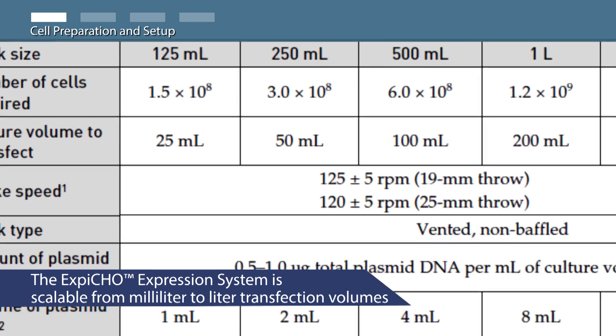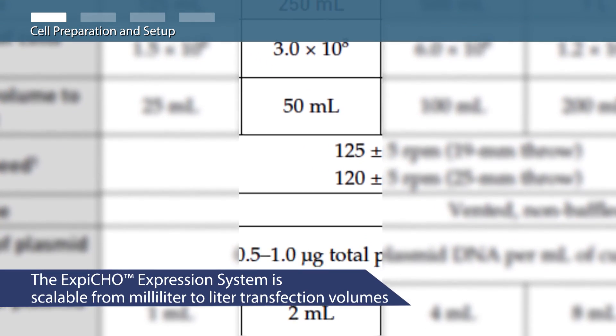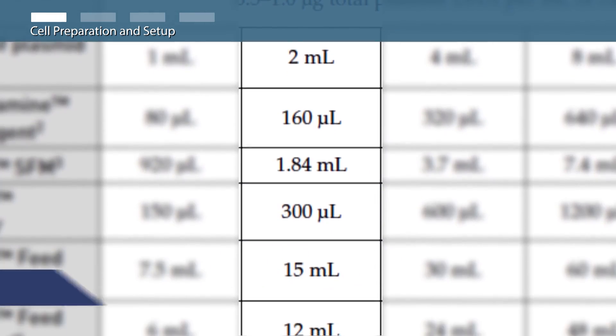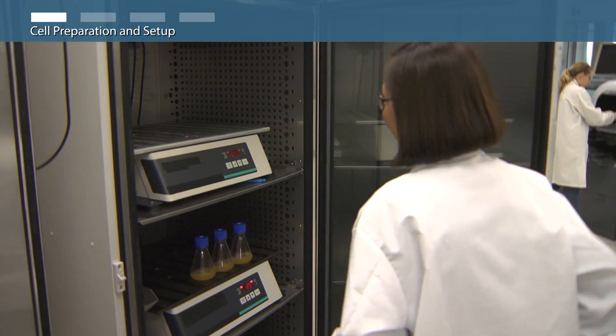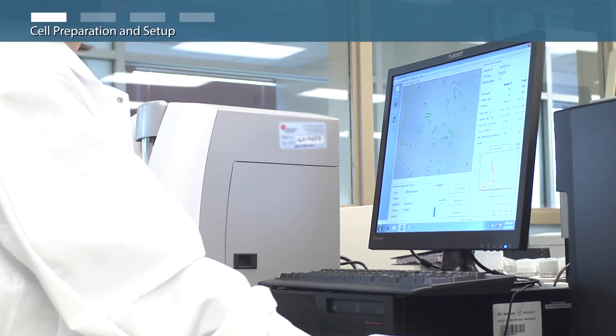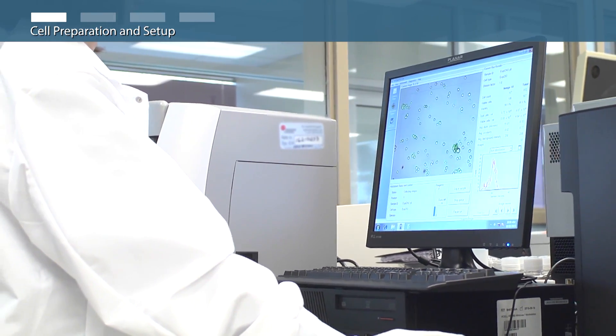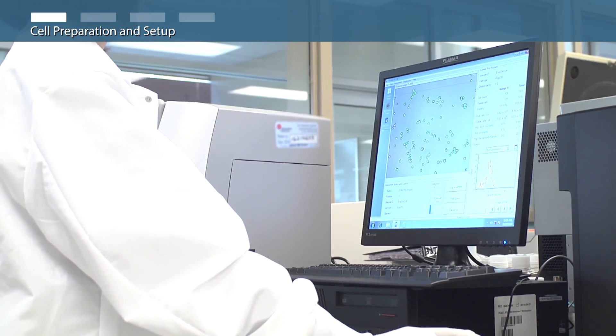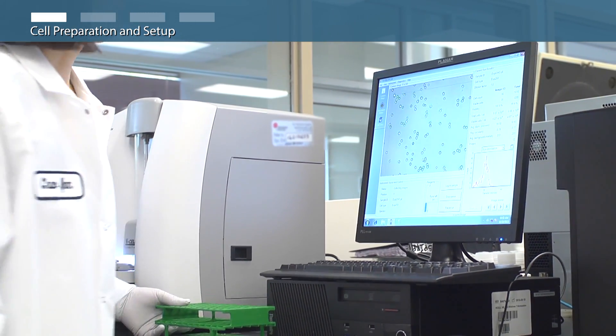We will follow the 250 milliliter flask format of the XBCHO expression system transfection protocol. On the day of transfection, re-examine cell density and viability. The cells should reach a density of 8 to 10 million viable cells per milliliter and viability should be 95 to 99 percent to proceed with transfection.